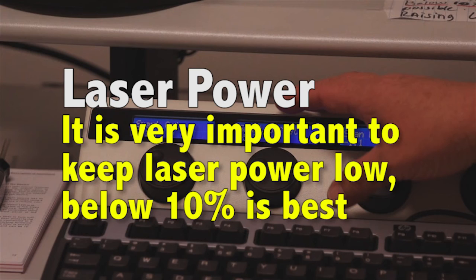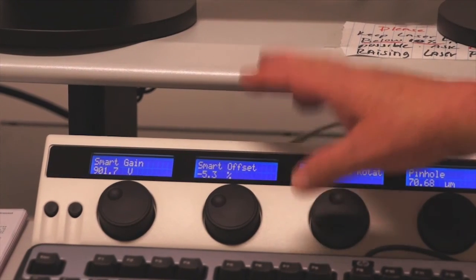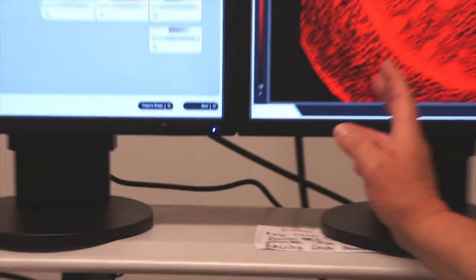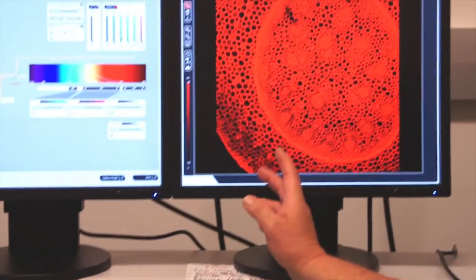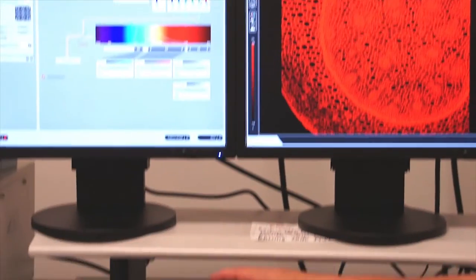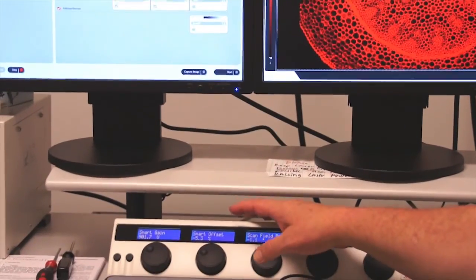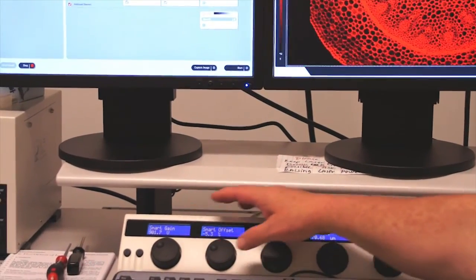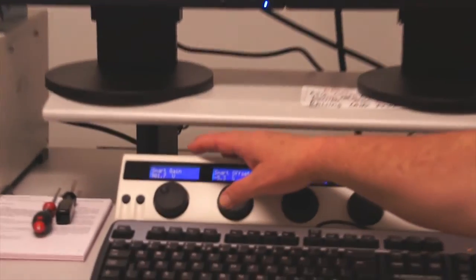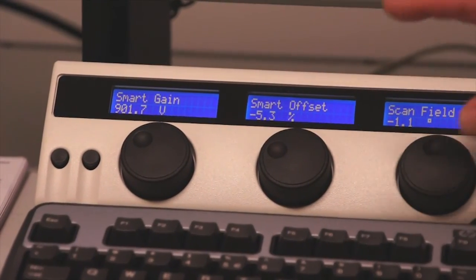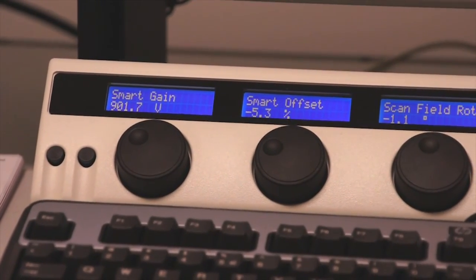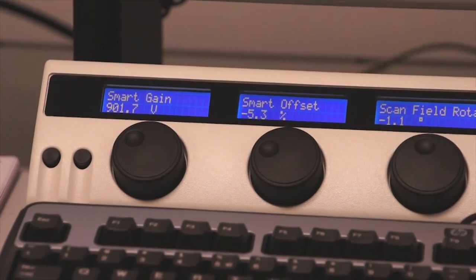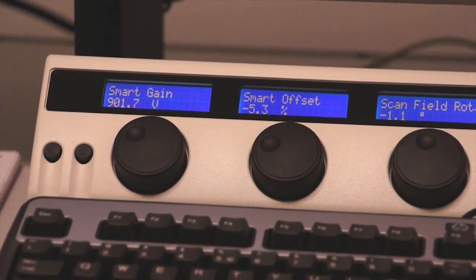Again, I want to keep my laser power low and increase the gain and offset of my photomultiplier tube so that I reduce the photo bleaching that takes place in my image and I reduce the amount of wear and tear on the laser. So a good rule of thumb is 900 on the smart gain and a negative number of 3 to 4 or 5 on the smart offset.